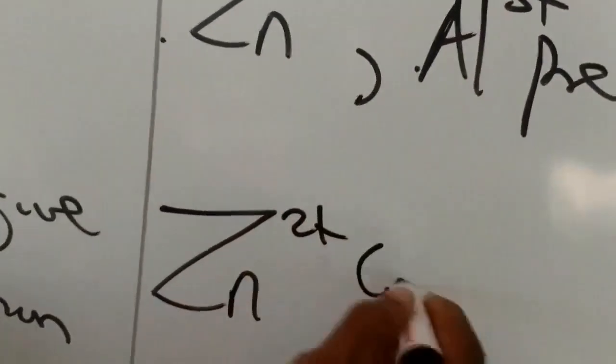In excess, one of them will dissolve. We are suspecting 2 inside this salt we tested. The one that will dissolve in excess is only zinc. When I say zinc 2 ion confirmed. Had it remained insoluble, we would have said aluminium ion present. So the cation inside this solution is zinc 2 ion, dissolved in excess of aqueous ammonia. So we remain connected as we go to the next test.